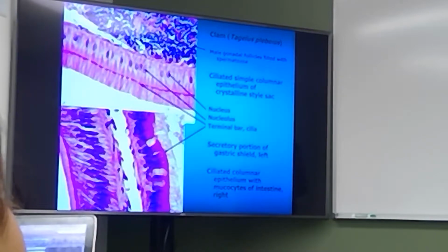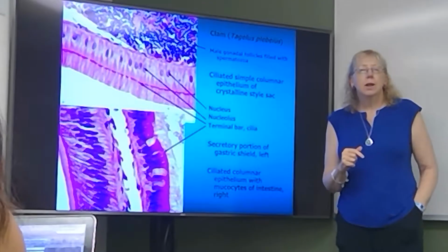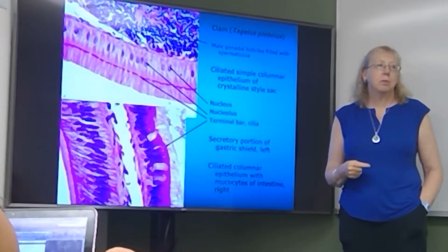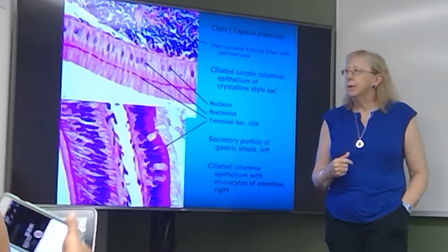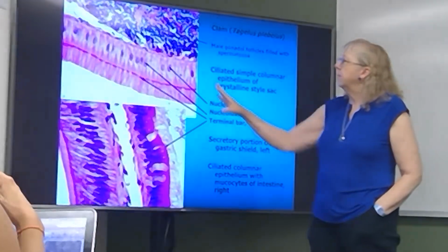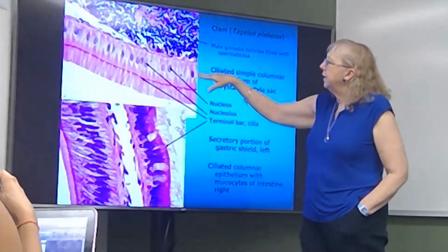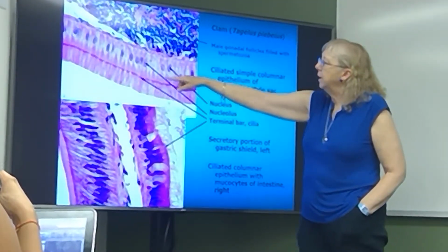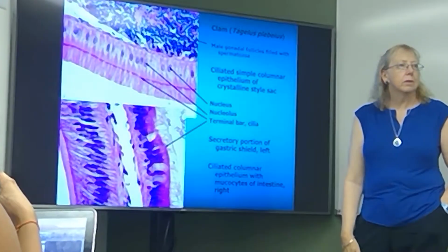These are a couple of interesting epithelia that I found. I was doing slide reading for the PLAM surveys that Maryland Department of Natural Resources conducts in the summers. And this one was from a razor clam. This is in their digestive system. A very nice, simple epithelium here, columnar epithelium. But boy, they sure had really long cilia on those cells.